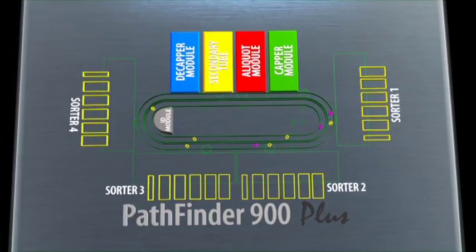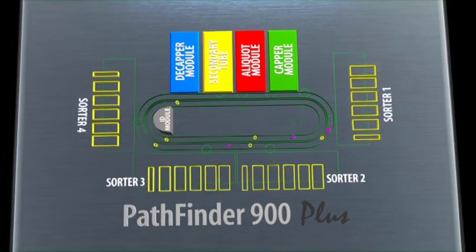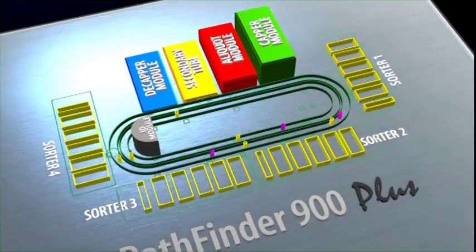In total, it's possible to have up to four sorter modules and up to four function modules.